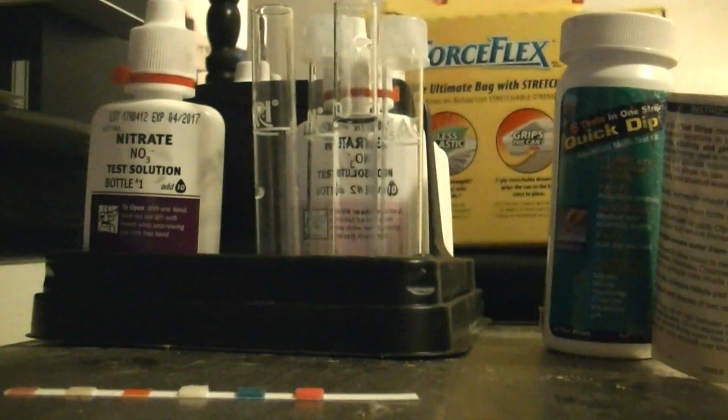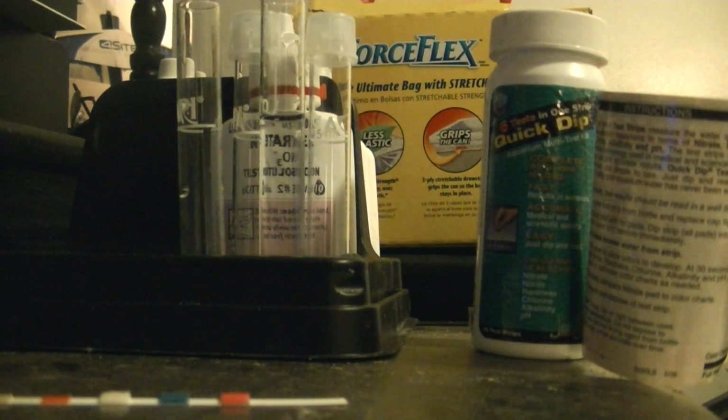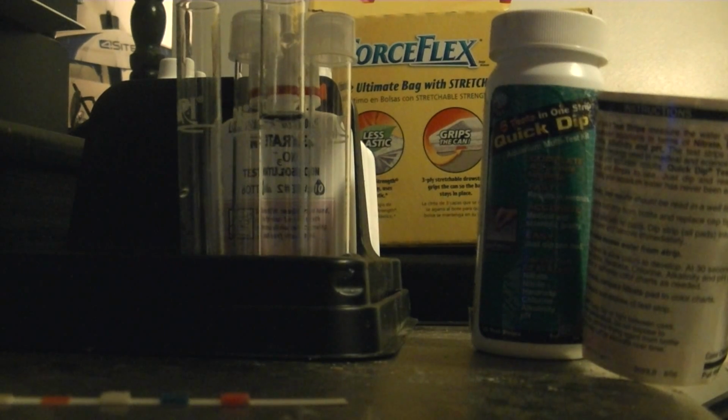Alright, now it's back in there. And I got nitrate solution number 1. You add 10 drops. As you can see, it says 10 over here. So I'm going to shake it up a little bit. Now I'm going to add 10 drops to the test tube we got here.